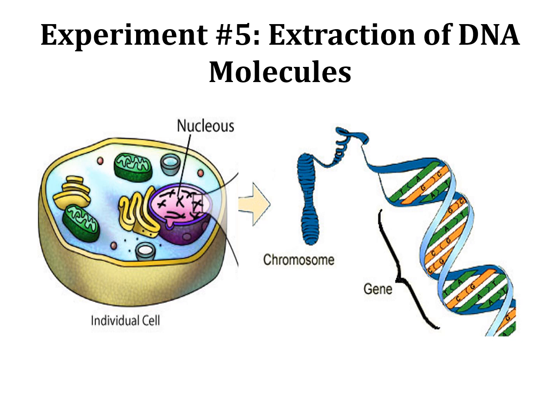So the aim for today is to break the cell open, to lyse the cell. So we're going to break this cell membrane right here. This is the cell membrane containing the phospholipid bilayer. The nuclear envelope also needs to be broken. It also contains a phospholipid bilayer. So we're going to be using the same method to break this cell membrane.